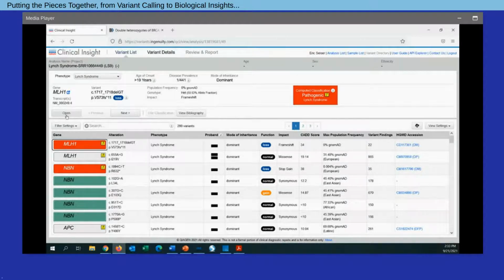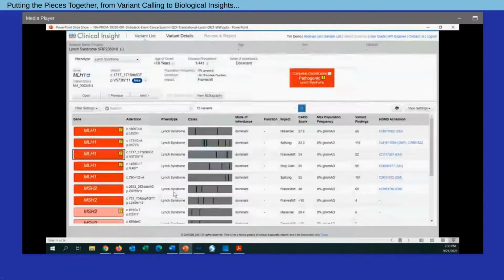Now, so far we've looked at this in the context of a singular sample. But what I do want to note is that also in our study, remember, we are dealing with a cohort of 84 samples with Lynch syndrome. So the software also provides a mechanism not only to analyze samples one at a time, but also to analyze a cohort of samples. What we're looking at in the slide here is that analysis looking across all 84 samples. And we've set it up to identify those variants that appear in 2 or more individuals within this cohort.